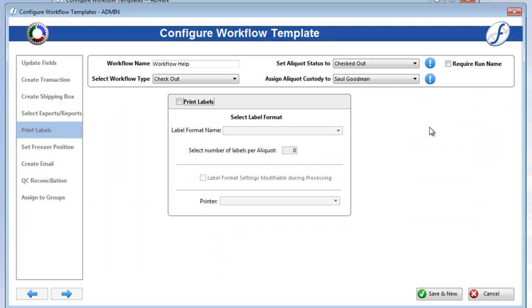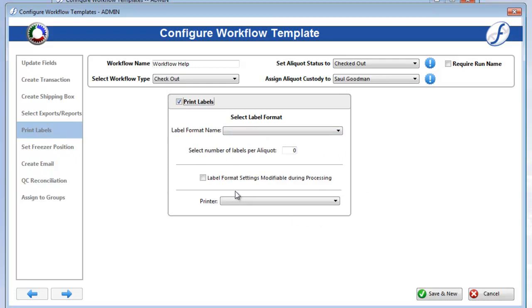The Print Labels page is where you can select a label format to print for each aliquot in the workflow after it is processed. Check on Print Labels to activate the fields like usual. If you want users to be able to modify these fields when processing the workflow, check on Label Format Settings Modifiable.